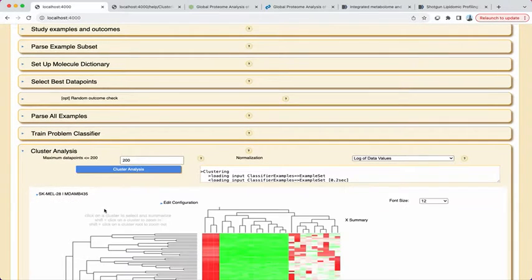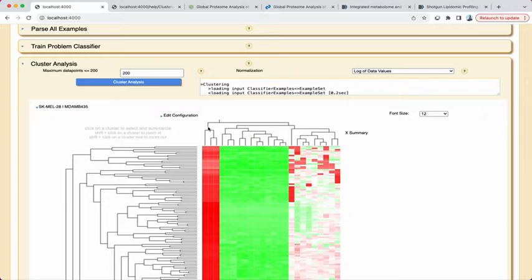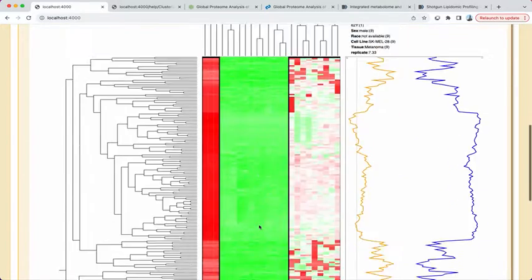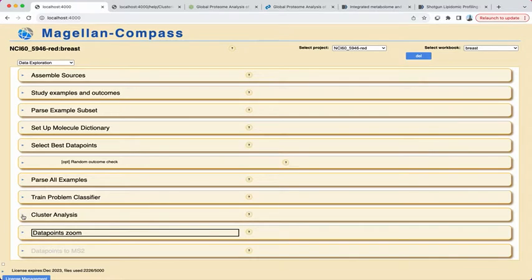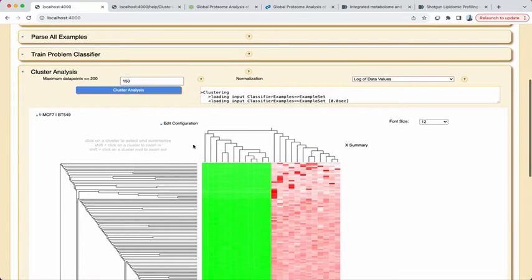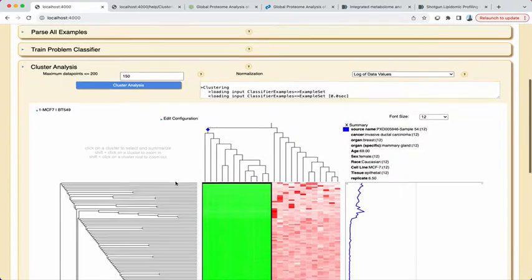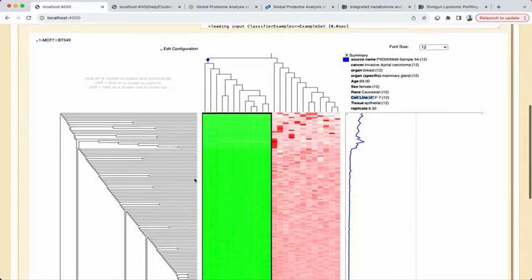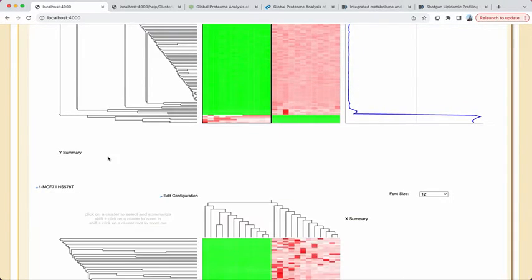Given that Compass uses MS1 data for its analysis, it works with unprocessed and non-curated data. One major advantage is that quality control problems with individual samples or groups of samples become readily apparent early in the analysis, allowing users to compare results that include and exclude such examples.